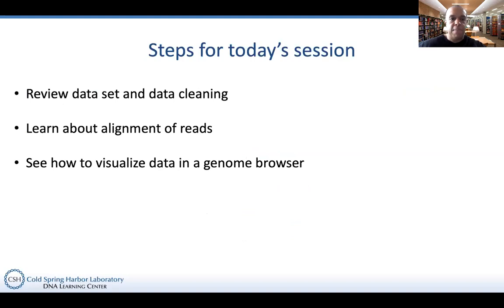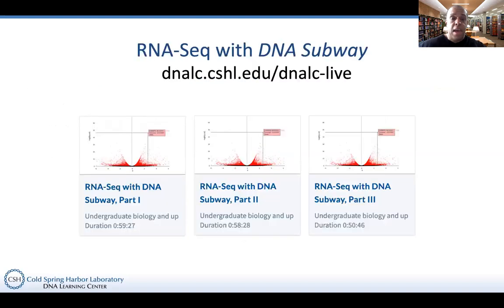What we're going to accomplish, like I said, after the review is we're going to go a little bit into alignment and also a visualization of those data. And this is also another shout out to the three-part series on RNA-Seq with DNA Subway. We're using very similar tools, on a different platform. And there I go into a lot of detail about an RNA-Seq experiment.